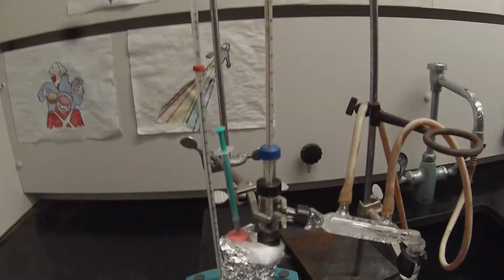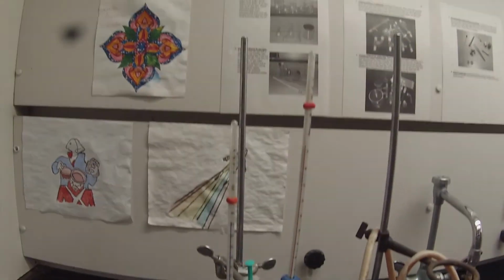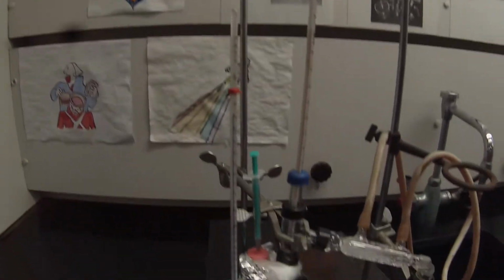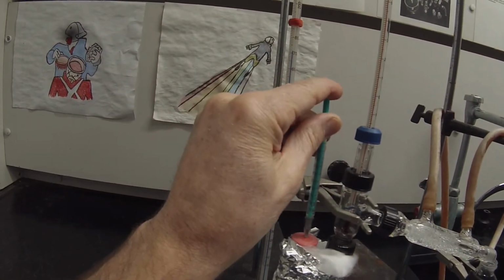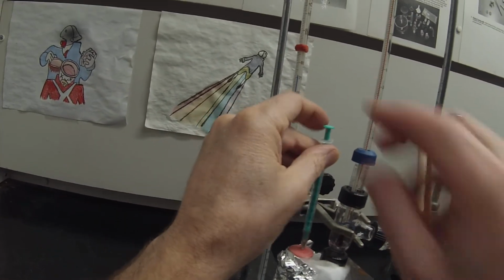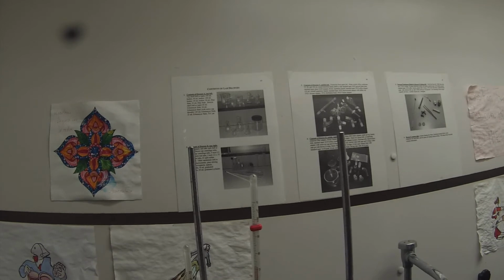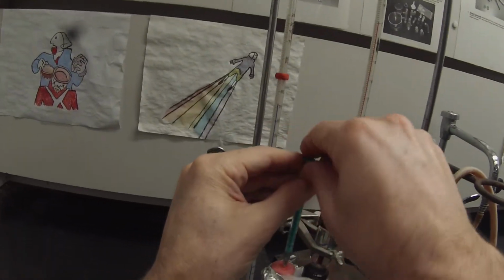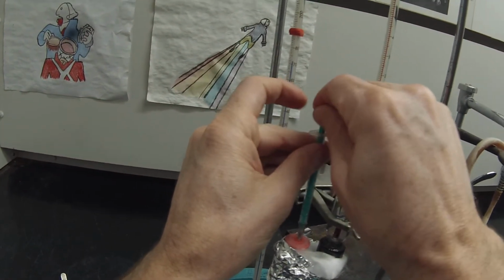And I think we expect a little less than 0.9 grams of the distillate. Density is a little less than 1. So we're going to add my last 0.1. Just open that up and squirt it down again. You can see that some of that liquid is actually being driven up the needle. Just make sure I push out the last of that liquid.